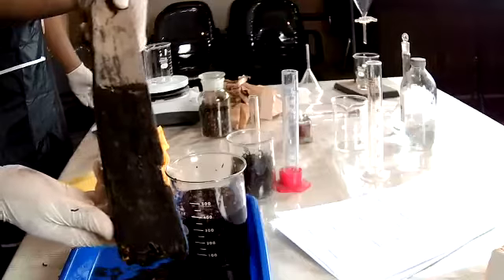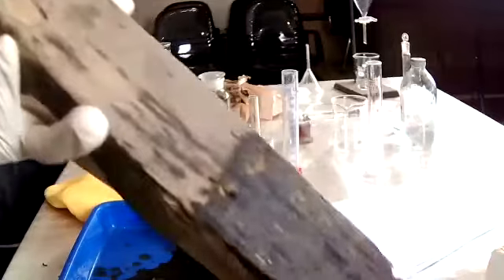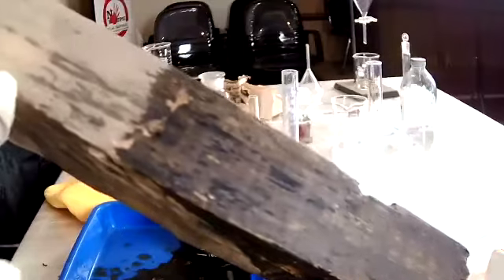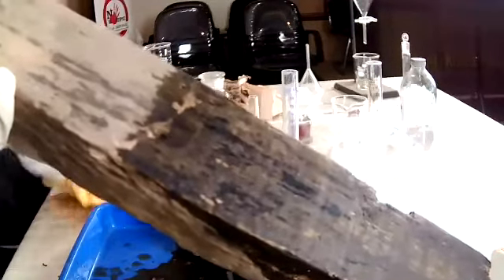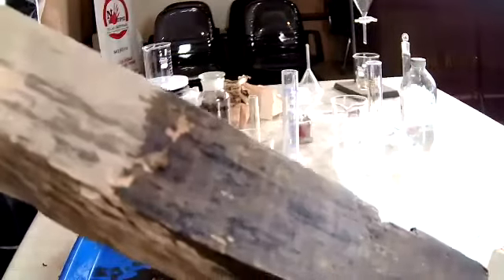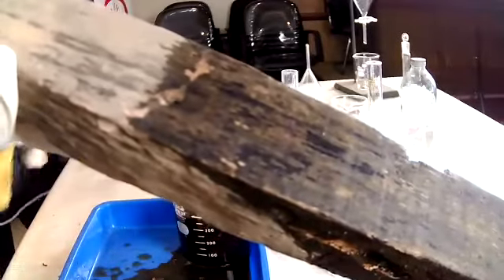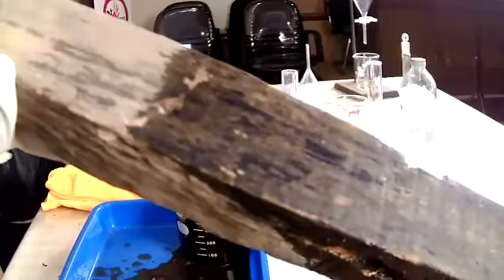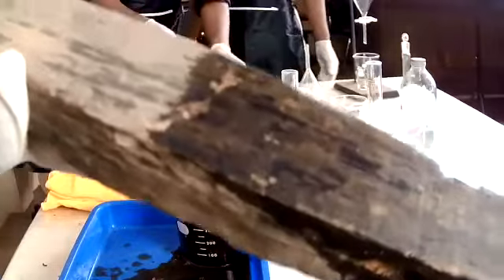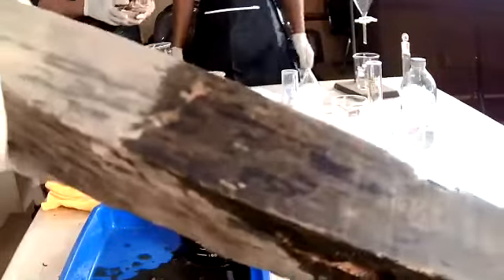And if you're wondering what ingredients or what agents we are using, we are now doing a traditional method of conserving or extracting ingredients for conserving wood materials. And what you see right now is this piece of wood that has been scrubbed with the solution, 5% tobacco solution, and then 5% of the extract of clove leaves with 400 milliliter of water.